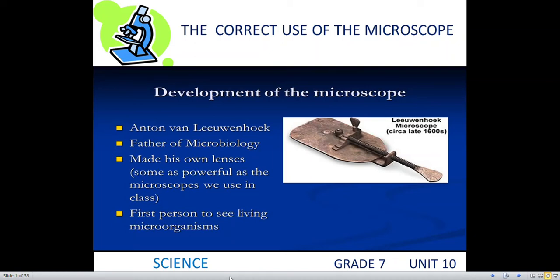Science, Grade 7, Unit 10. The correct use of the microscope.